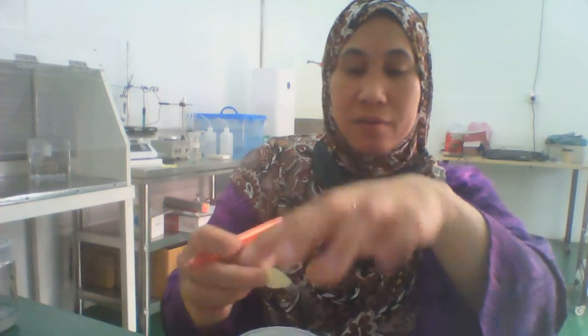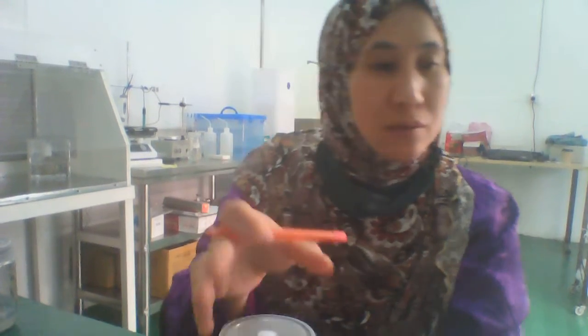Oh, see, this is not caladium, this is colocasia. So we'll see how the progress is in different media, because I put it in MS plus 1 BAP for quite some time, about 2 months, but the growth is really slow. It only multiplied from 1 to 3 new plants, so I need to change it. And so this one I use the same media, MS T8 colocasia sub 1 and the date.